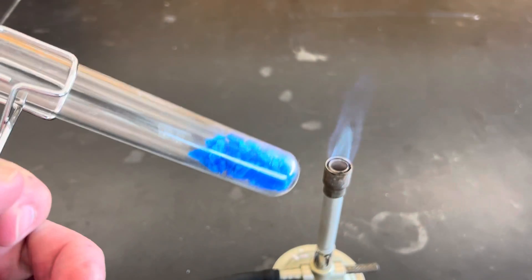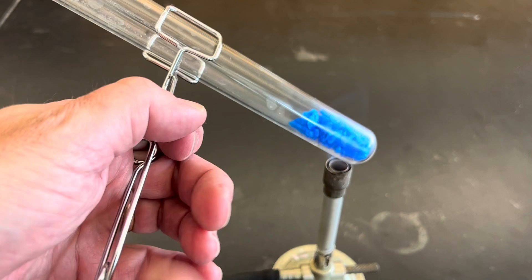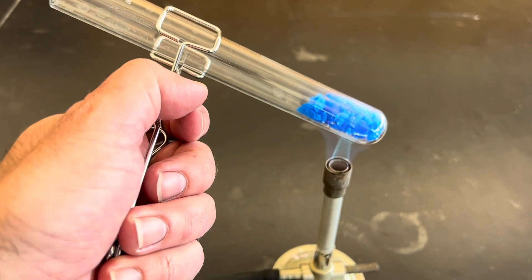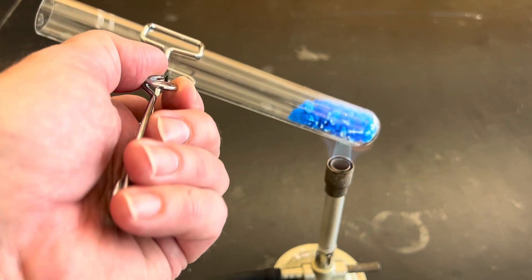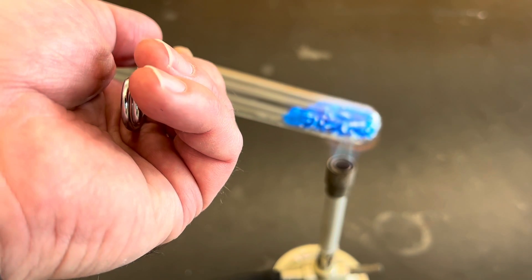I want to light my Bunsen burner and put this in the Bunsen burner and show you what happens. The copper(II) sulfate crystals are going to go into my Bunsen burner flame, and as I'm heating it something interesting is happening. First of all, you might be able to see that there's a color change happening. Some of those crystals are turning from blue to white.